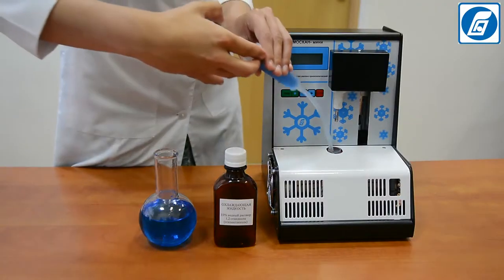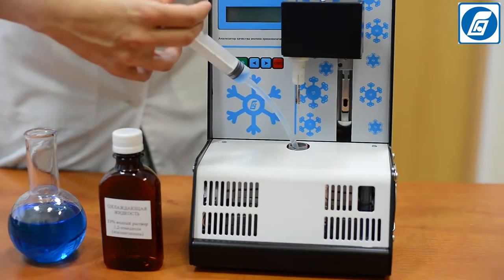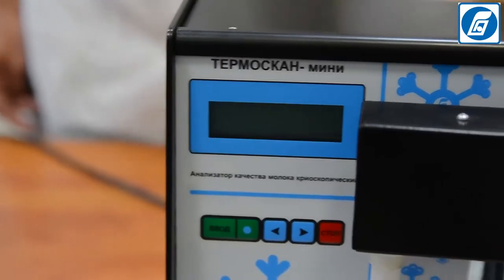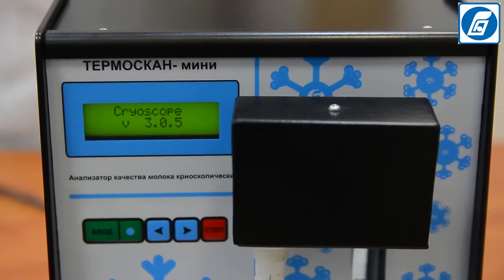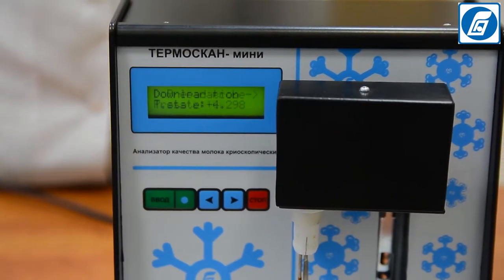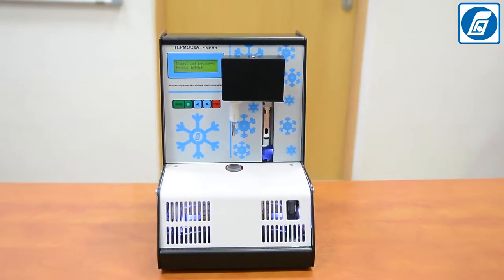The approximate volume of cooling liquid to be filled is 120 ml. Switch on the analyzer by putting the power switch in position 1. The following messages will appear on the analyzer's display successively: the analyzer's model, the software version, and the serial number. Leave the analyzer switched on for 30 minutes to establish the operation mode.